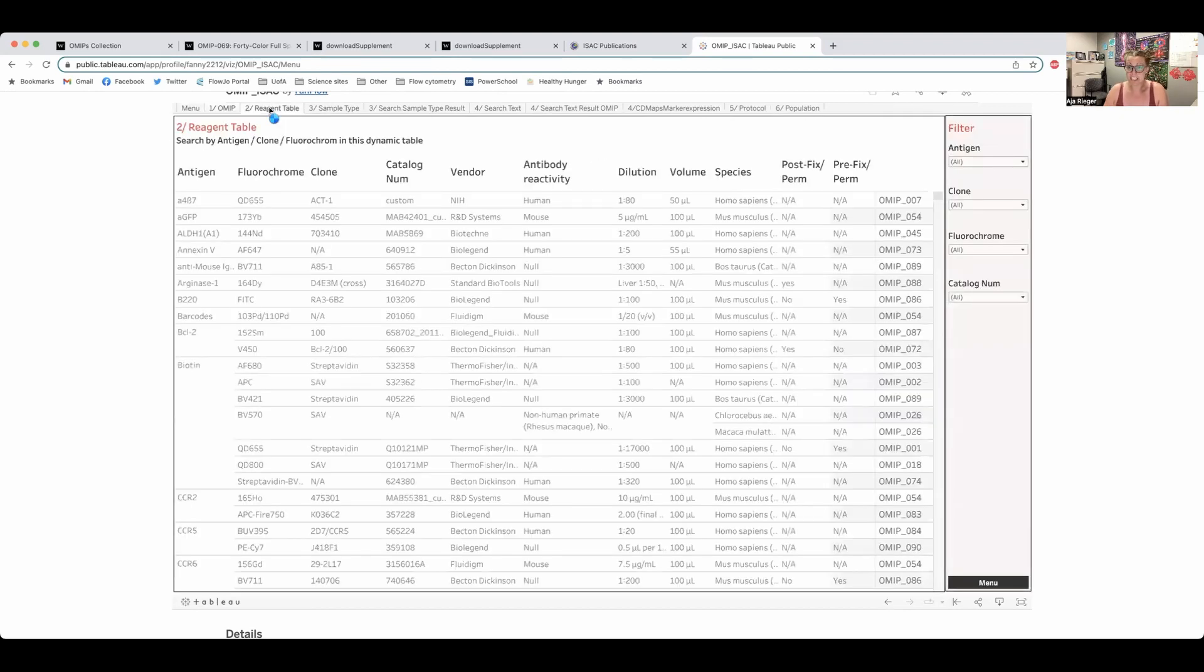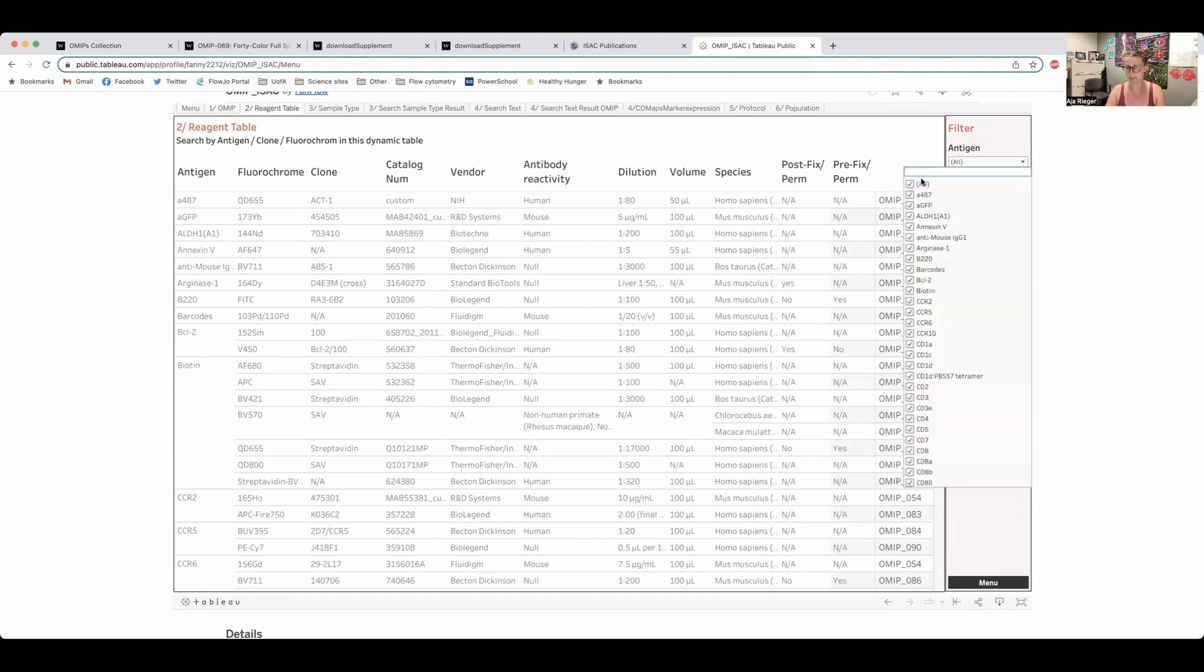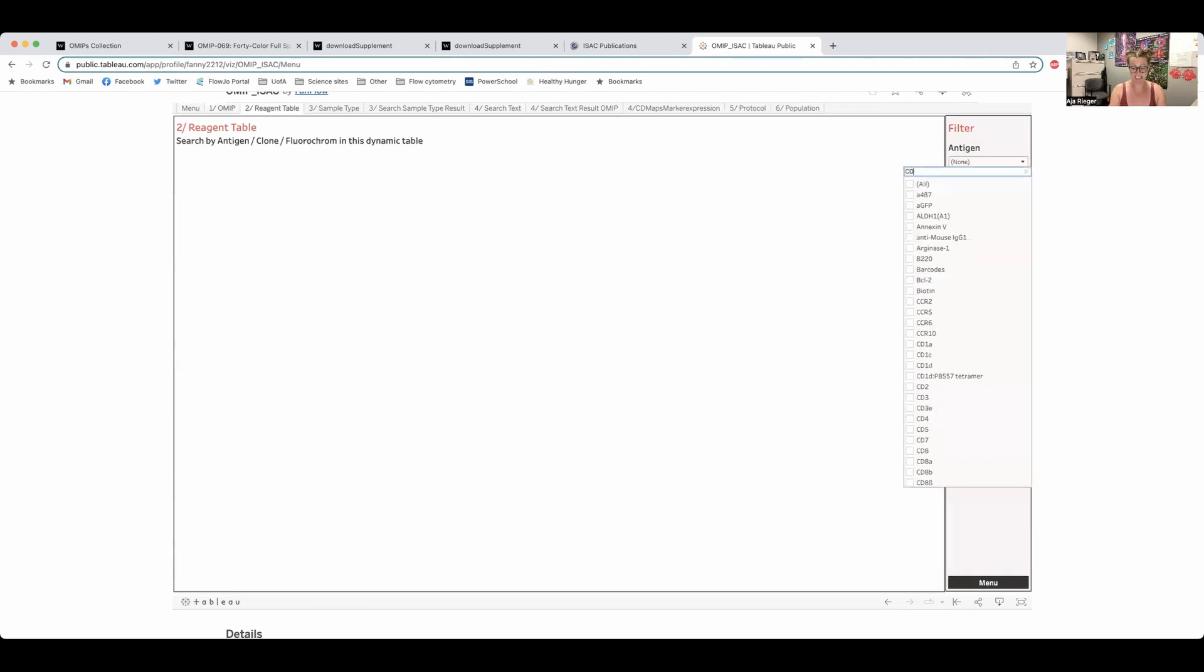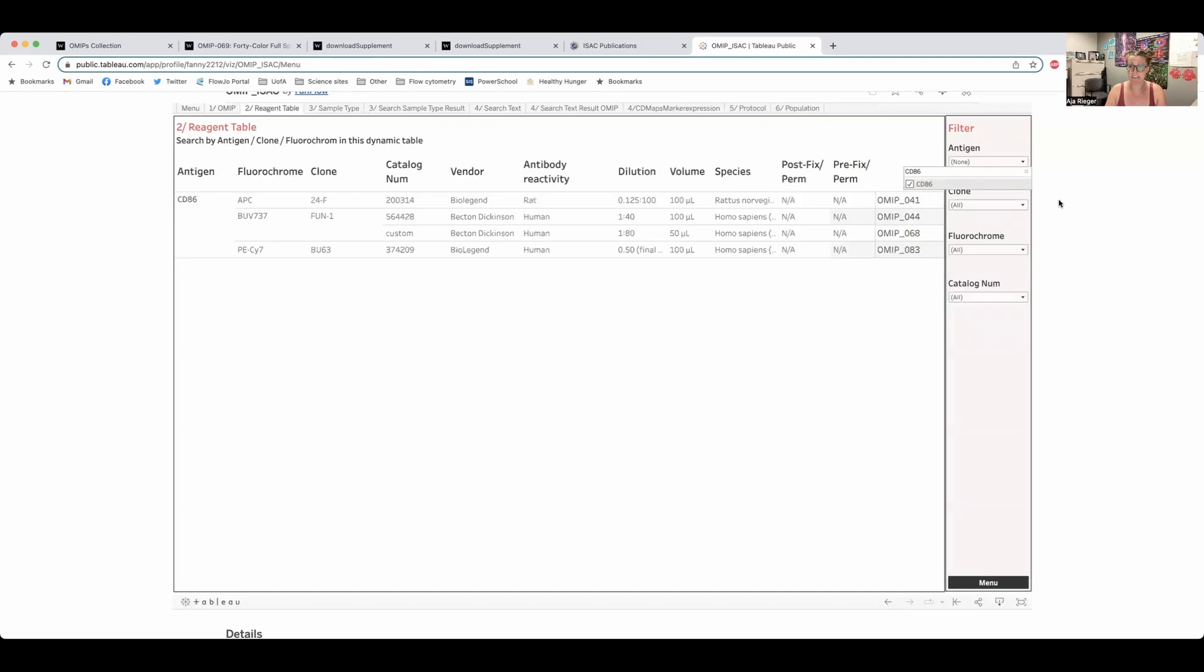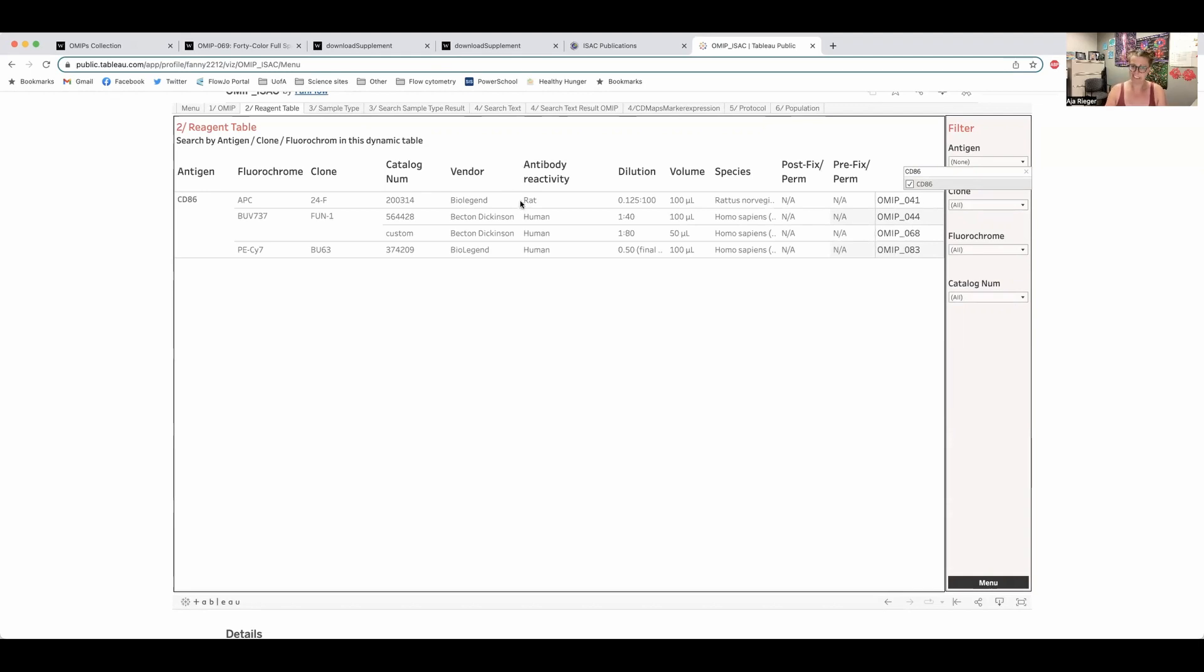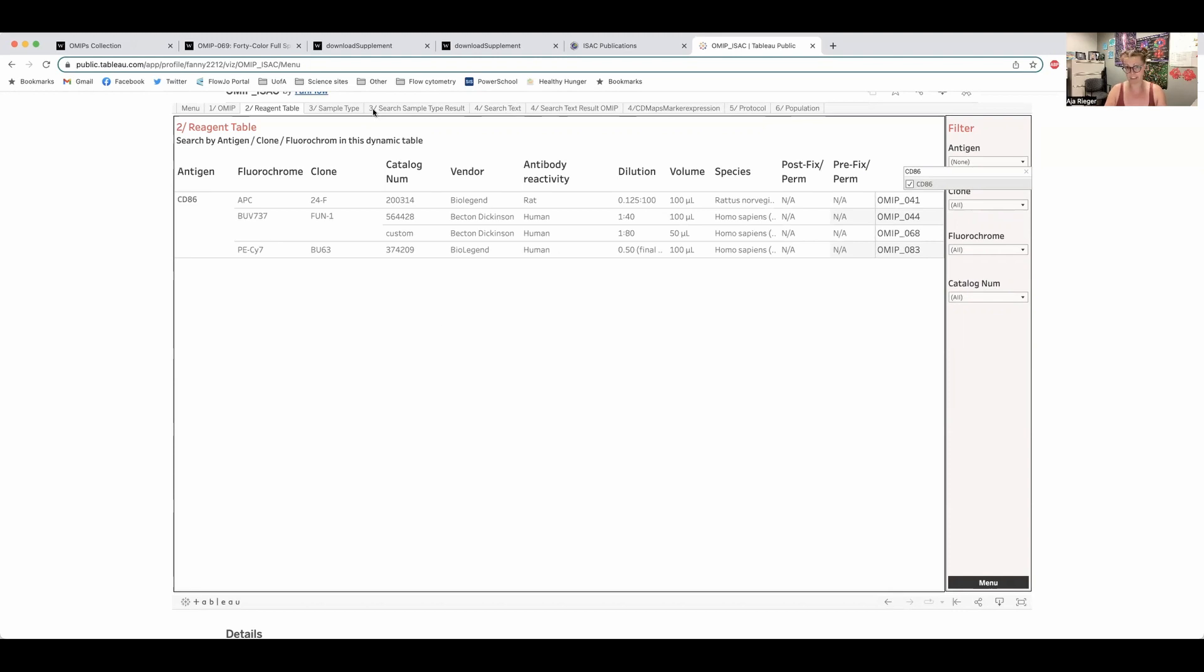The reagent table, say you are interested in, let's go with CD86 as a random one. So we'll check that and this will give us all the OMIPs that use CD86 and we can see what they react against. So if we're looking for a rat OMIP with CD86, we'd be looking at OMIP 41 or the human ones, we can look at any of these three here. So if there's a marker or a combination of markers that you want to look at or if you know a specific clone, that's where you would search this.